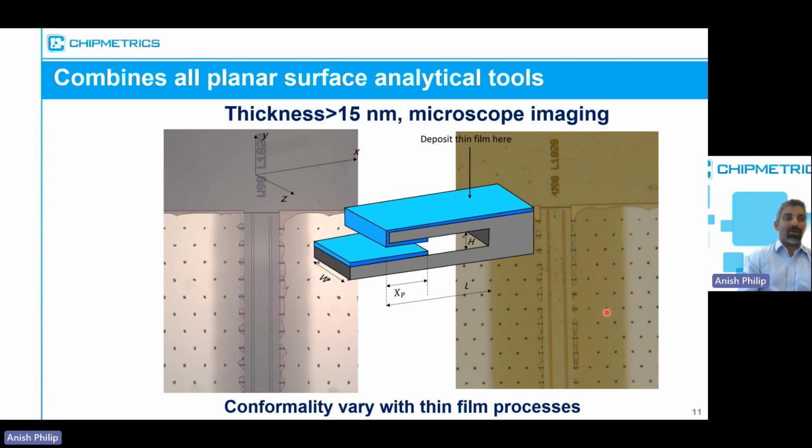And similar for another process. In this case, this was for epsilon iron oxide, and this was for the aluminum oxide deposition. So this penetration depth also depends very much on the materials and also the ALD process used. For example, you can improve the penetration depth by increasing the pulse length of your process.